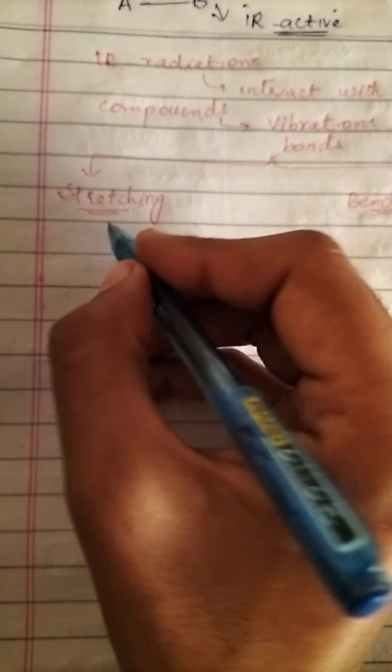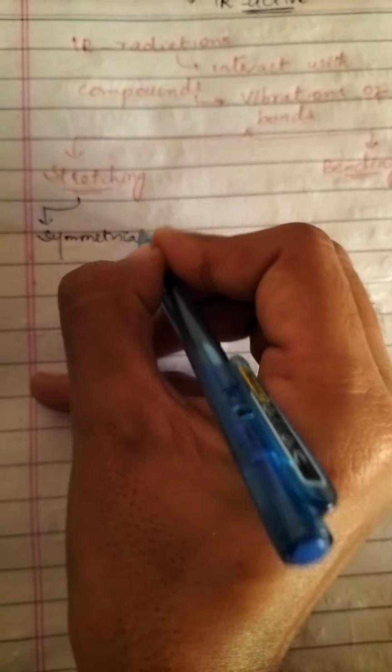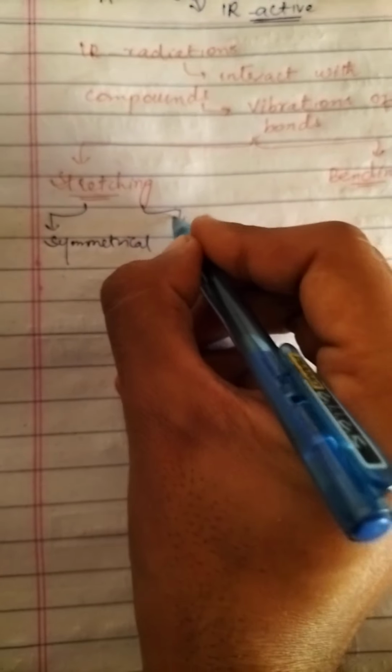And stretching may be of two types: symmetrical or the asymmetrical.